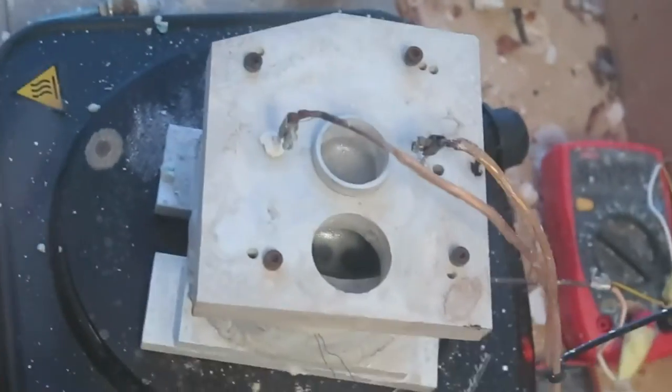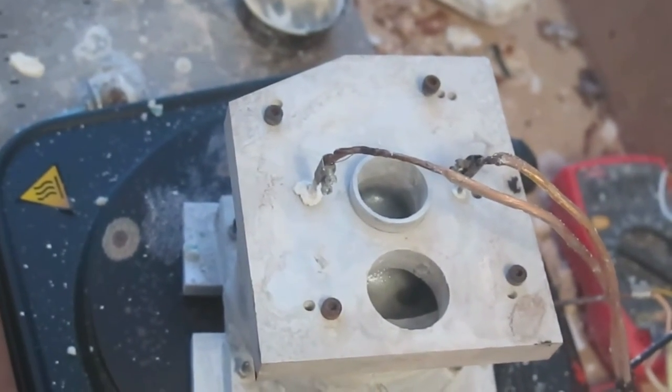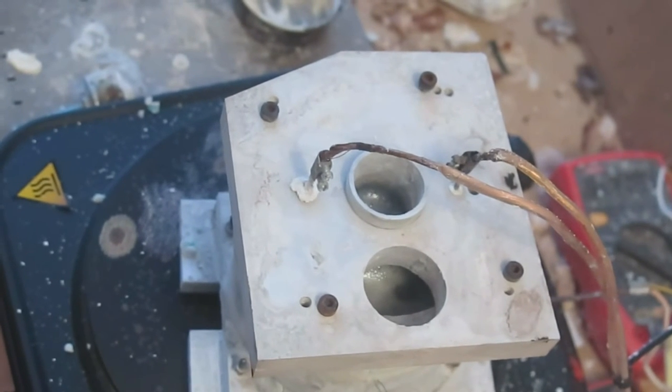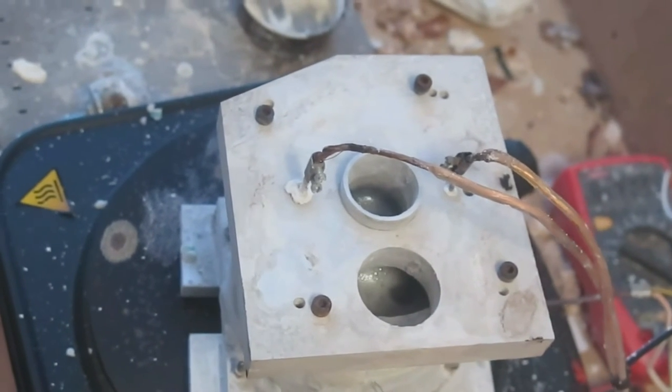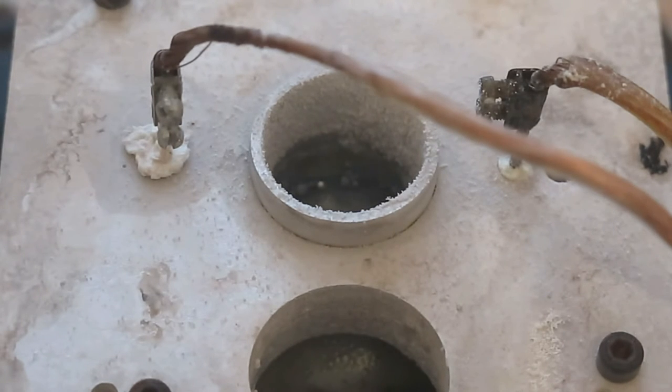Now turn on the power supply once again. As current removes all of the water present in the salt, small drops of sodium will appear. Some of them will burst into the air, igniting the hydrogen gas produced. Once this happens, turn off the power supply and place a lid on the collection tube. This is to keep the sodium metal under an inert atmosphere and to prevent fuming into the air.